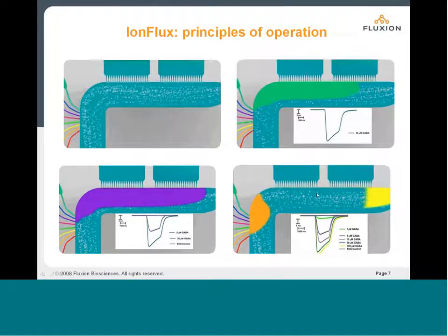And this would be just going on, showing that we can achieve very rapid responses, or very rapid deliveries, between different compound solutions. And this is in marked contrast to other versions of automated patch clamps that are currently on the market and have been for some time, where the solutions are all being held within a plate, picked up by a pipetting robot, and brought over to the recording.